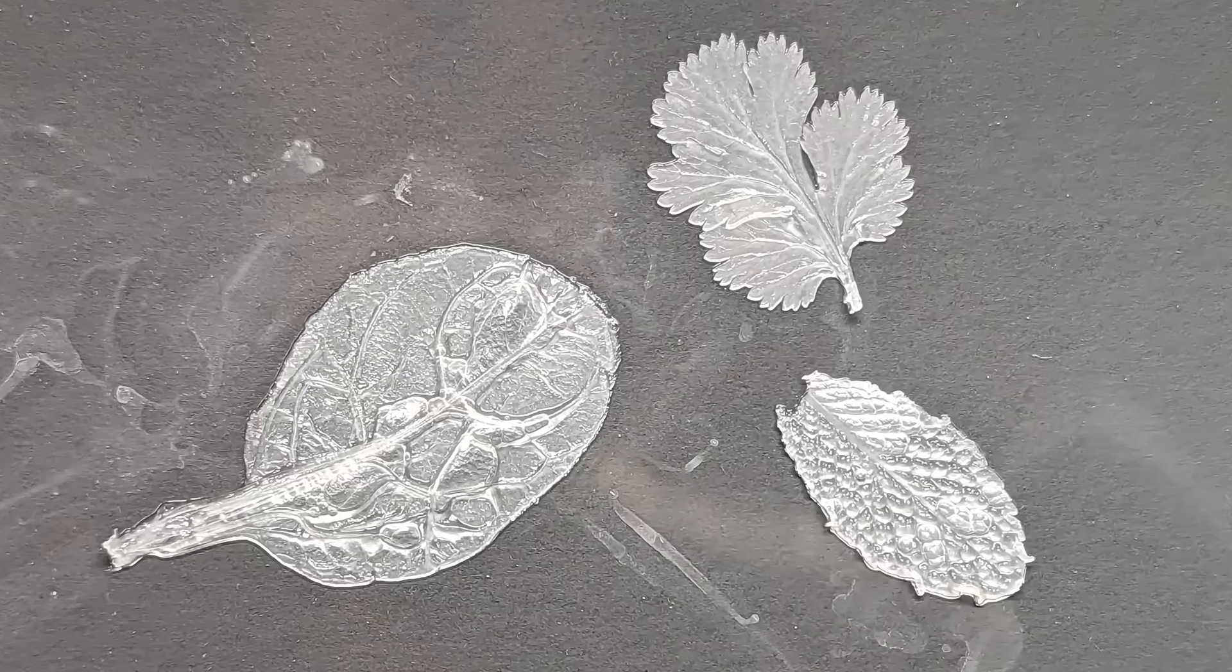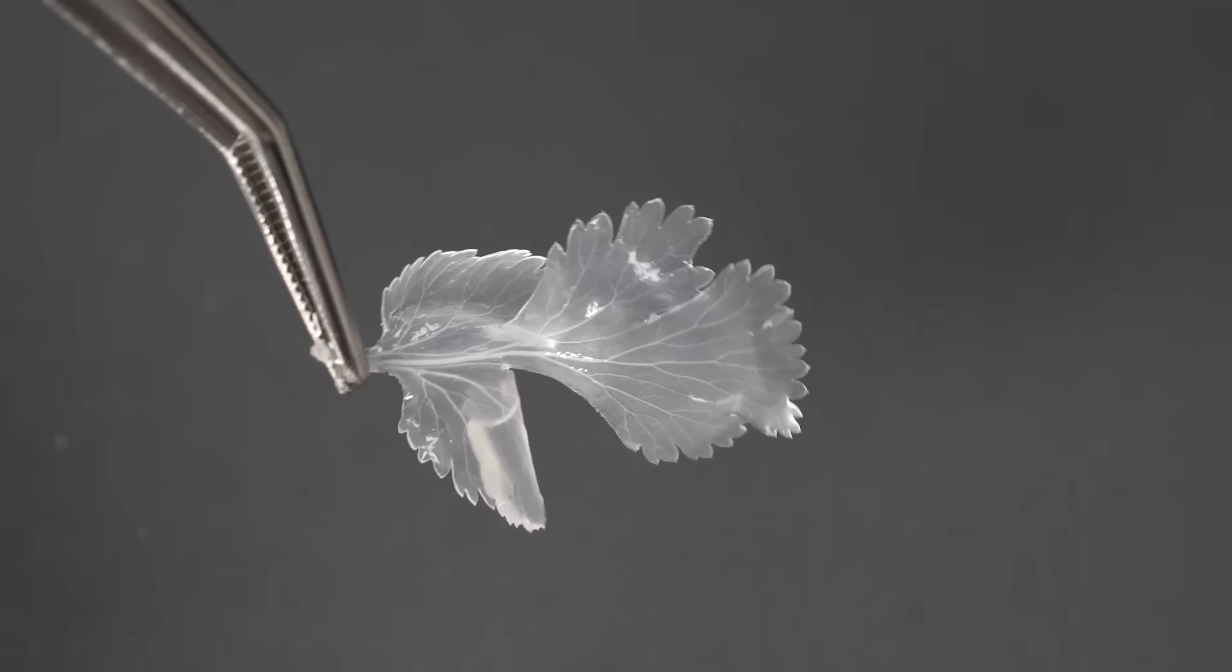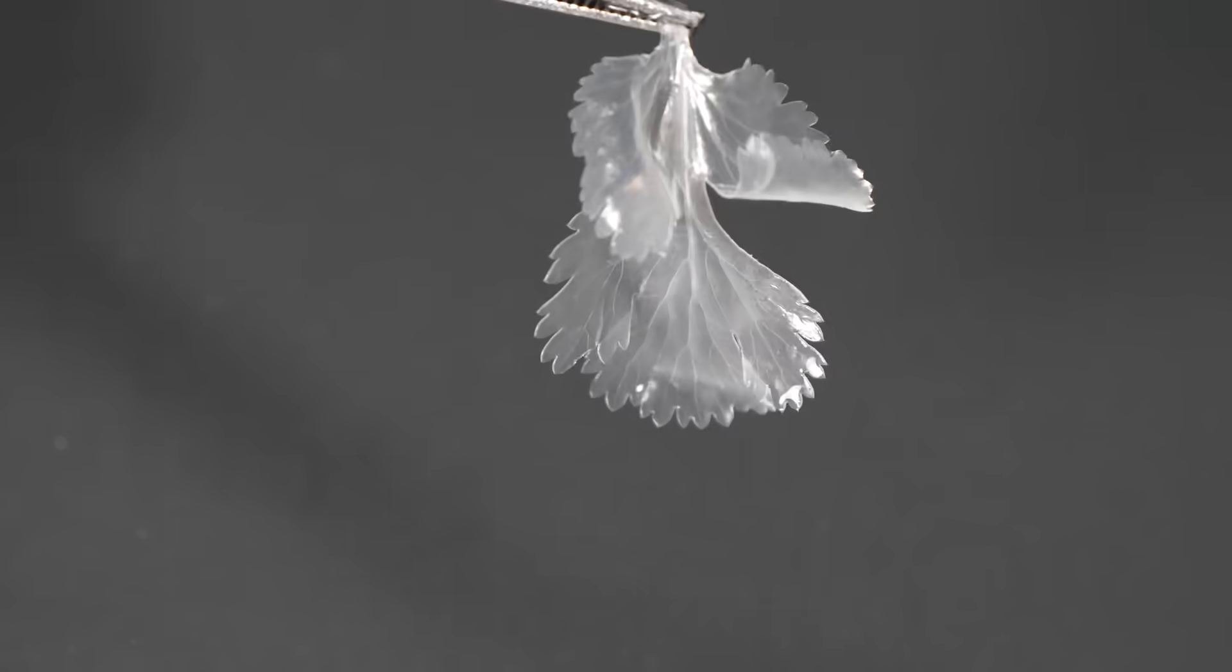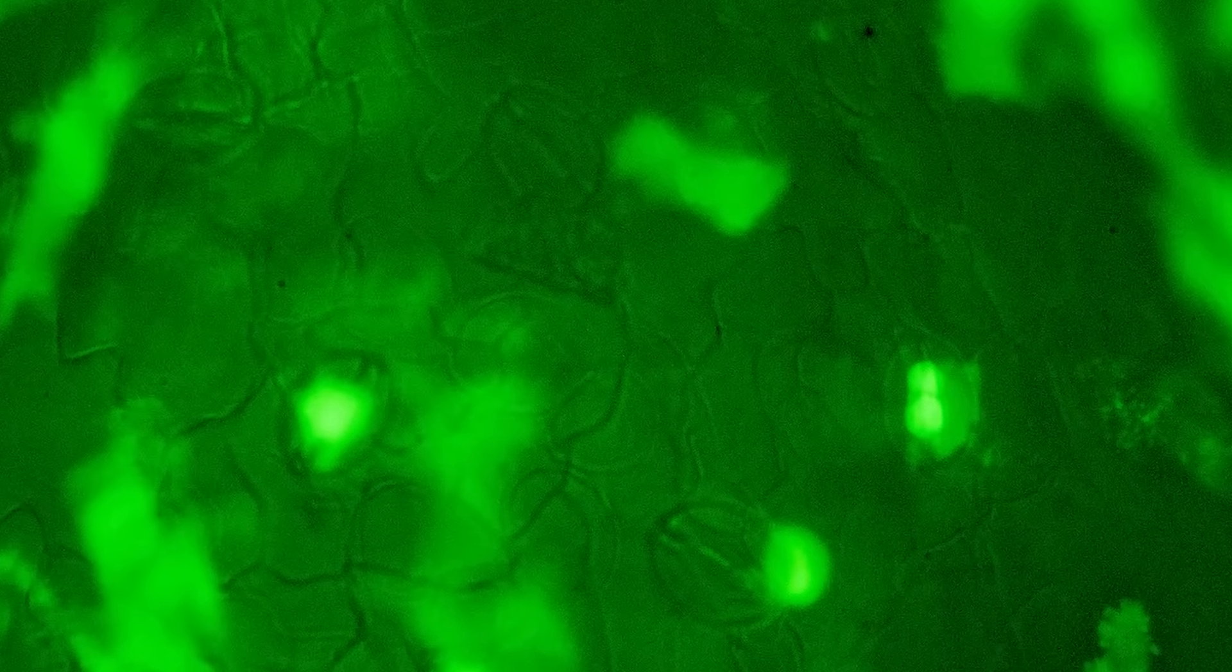There was also some noticeable differences based on which type of leaf we're looking at. The mint is heavily textured, so it's hard to get things in focus, but the cells grow happily in the ridges and valleys. The cilantro was probably the easiest to see the cells, since it was so nice and flat, and again, the cells loved it and adhered beautifully. You can even see the leaf texture in some places. Finally, the spinach was really cool, because if you zoom in, you can see the stomata of the leaves, or at least the remains of them, in and amongst the glowing fibroblasts.